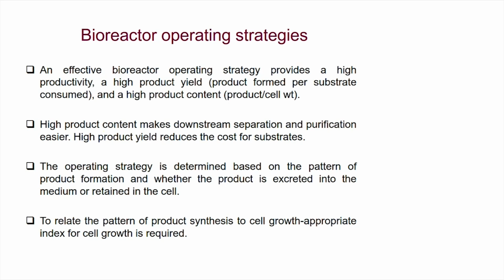In what way? We have learnt about different strategies. You can count now, there are n number of strategies which we have learned which can improve the product yield, secondary metabolite yield and productivity. Now, the limitation in the reactor would be that a time will come when I will have to stop the reactor, be it any reactor. What will be that time? That time would invariably be when the nutrients are done. Can I do anything to never allow nutrients to be done till whatever point I want? That is what you can overcome with your mode of cultivation.